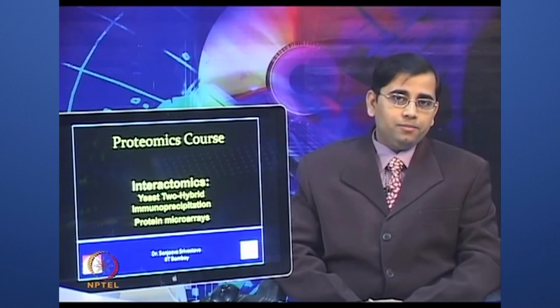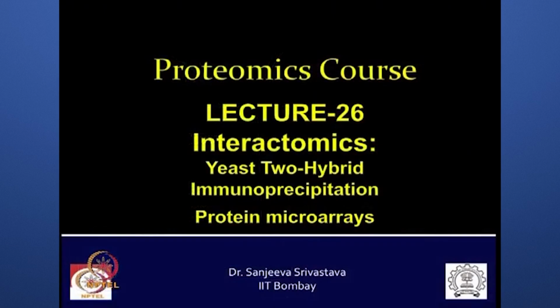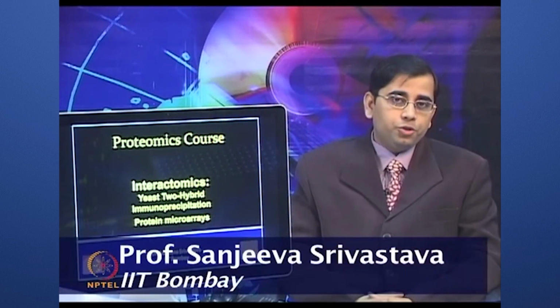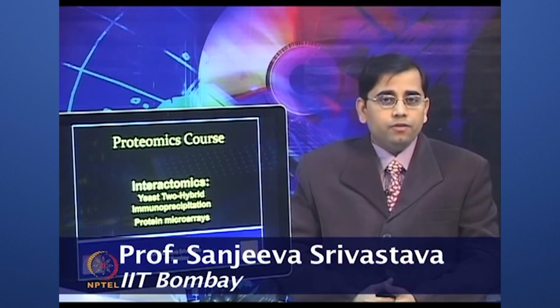Welcome to the Proteomics course. Today we will talk about Interactomics, which is studying interactions of proteins and other biomolecules. We will discuss various types of techniques such as yeast two-hybrid, immunoprecipitation and protein microarrays.